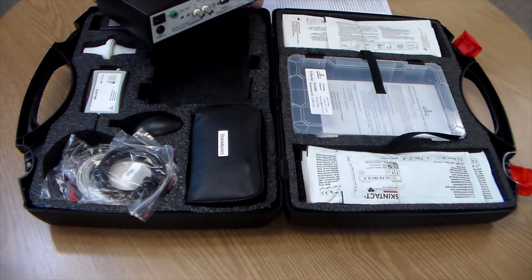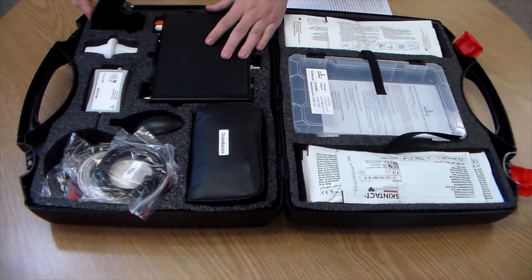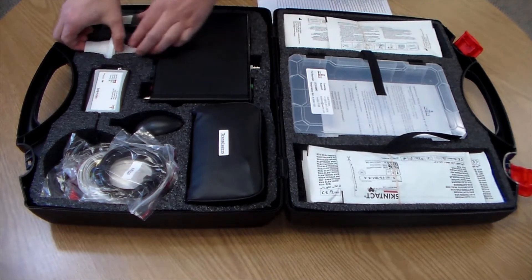The power supply is located next to the box. Your spirometer flow head is located here.